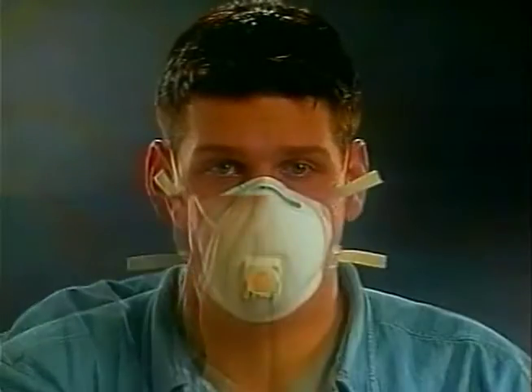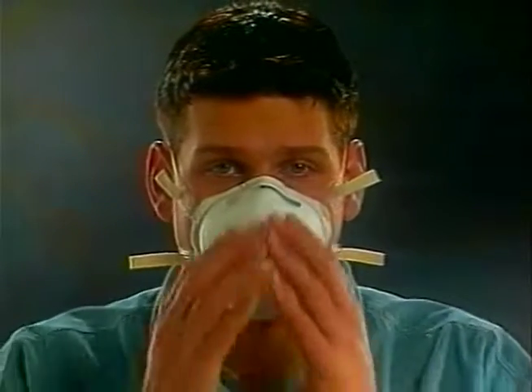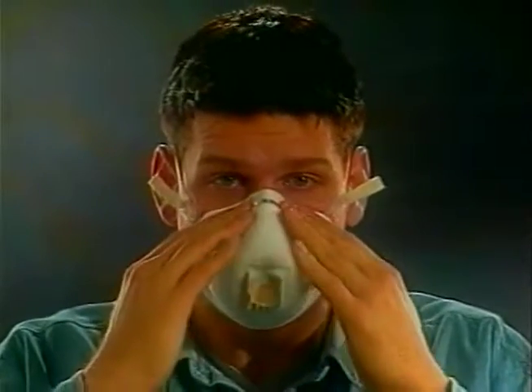For a disposable respirator with a valve, place both hands over the respirator and inhale sharply. The respirator should collapse slightly. If air leaks around the nose, readjust the nose piece. If it leaks around the edges of the respirator, work the straps back along the sides of your head or tighten the straps if they are adjustable. Repeat the procedure if necessary. A respirator that does not fit well should not be worn because it will not give the proper protection.